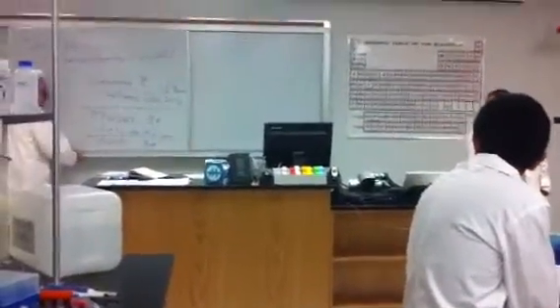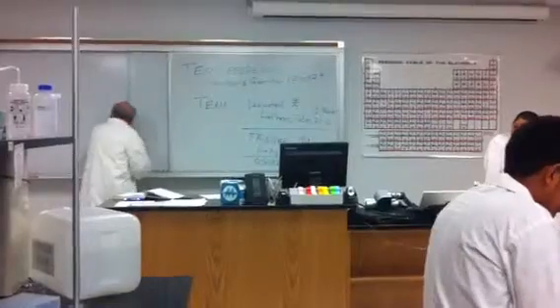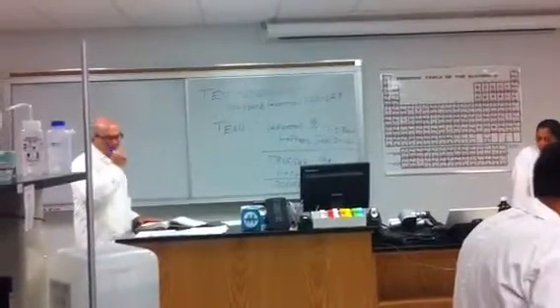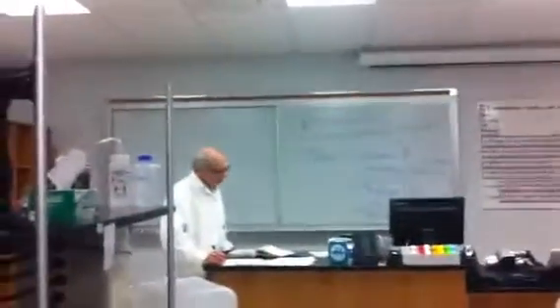Now, the rubber hits the road here in terms of the calculations. We want people to work alone. However, this is a rather demanding experimental report in terms of how much material you have to calculate and prepare. So I think it's only fair that the calculations on the Excel be shared, worked jointly. Everybody work together on it. Because that's a lot of data, a lot of graphics. Let's show just one typical case here. Let's just look at tube 2. Here's tube 2.